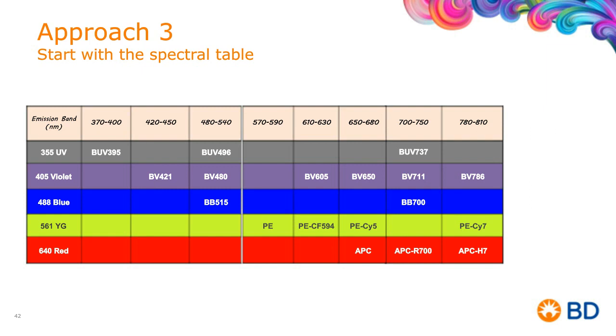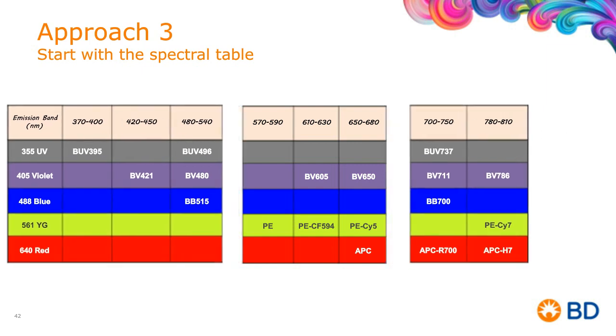So when I look at this, the first step that he does is he breaks all the laser lines by the wavelength down. And he puts them into 3 different sets, from the blue-greens, the short wavelengths, to the near-infrareds, to that central zone that's a lot of trouble.